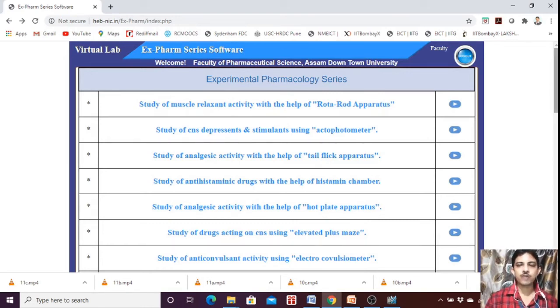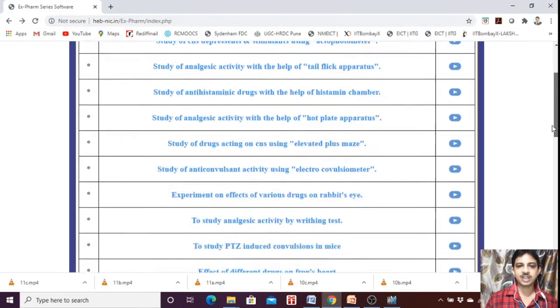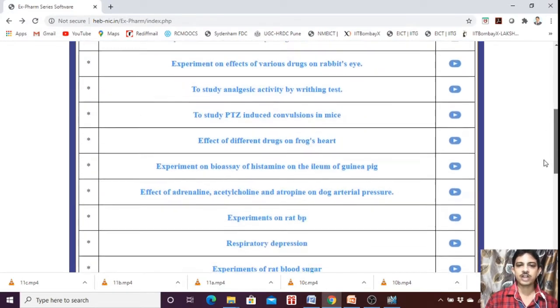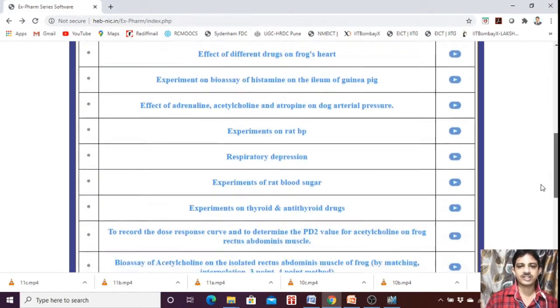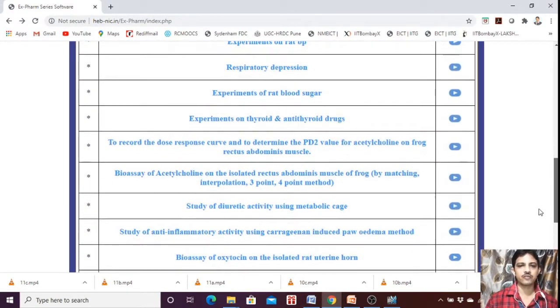Now we are going to perform the CRC, or DRC, of Acetylcholine.